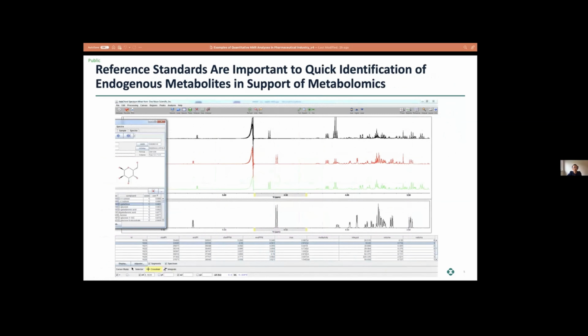Second, in some cases we not just want to solve the chemical structures, but we want to know how the chemical structures relate to the NMR spectrum pattern. In metabolomics, for example, in order to avoid looking for every single chemical structure, we established the 800 endogenous metabolites library.